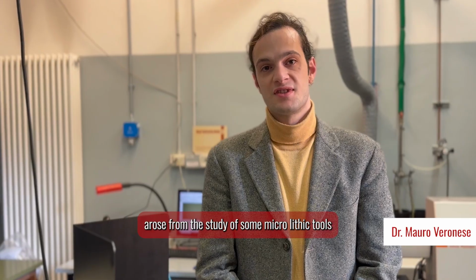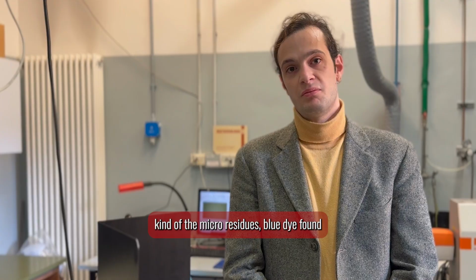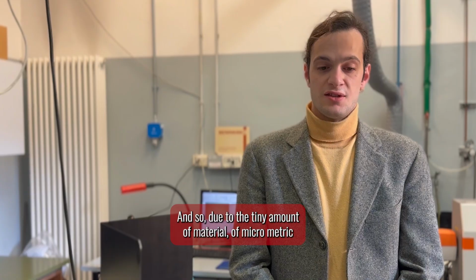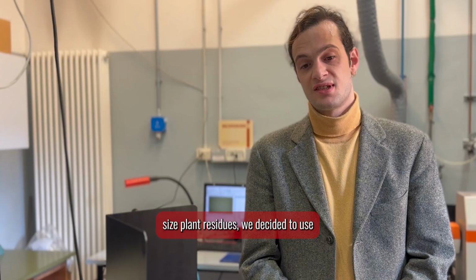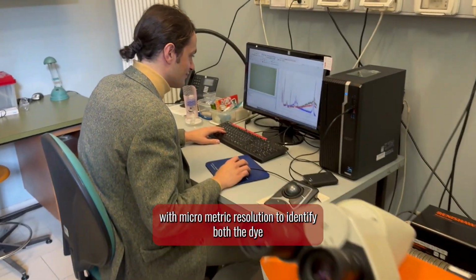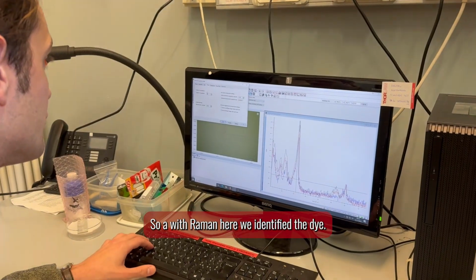The specific research topic arose from the study of some microlithic tools found in the Caucasus region, dated to the Upper Palaeolithic. So with a colleague from Venice, we wanted to identify this kind of micro-residues, blue-dyed, found on the active area of these tools. Due to the tiny amount of material, micrometric-size plant residues, we decided to use vibrational spectroscopy with micrometric resolution to identify both the dye and the vegetal residues to which this dye was adhering. So with the Raman here, we identified the dye.